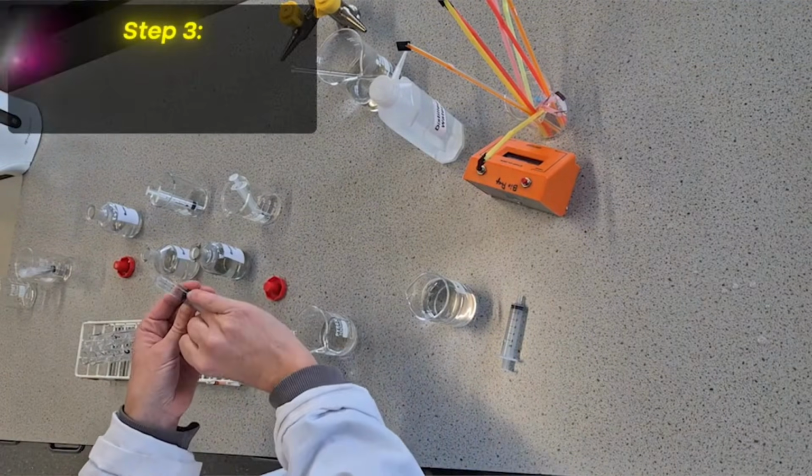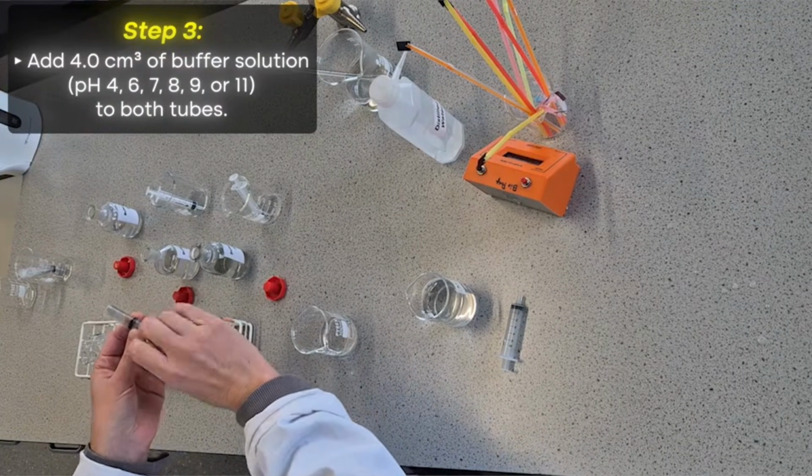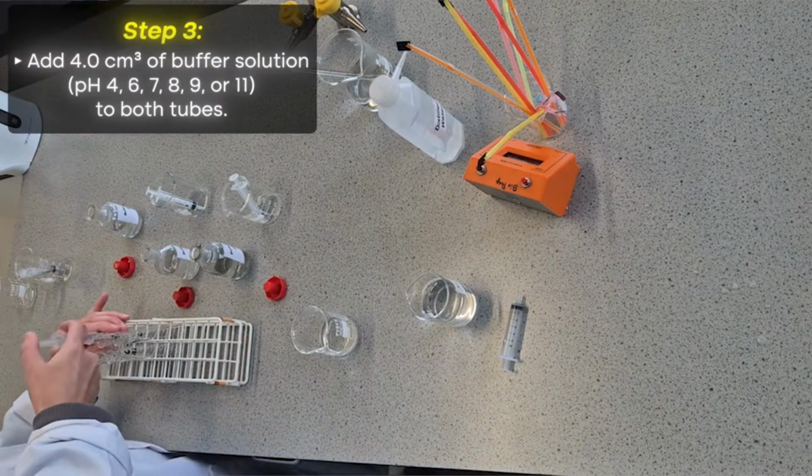And when they're using the syringe, make sure the bottom of the plunger is at the black line for 4. So 4 centimeters cubed.